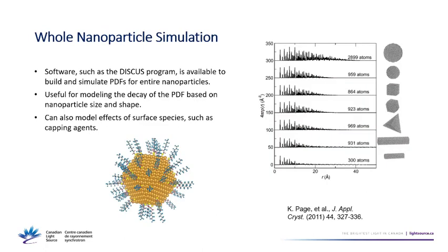And the last thing I want to mention is that there's also software. There's this program called DISCUS. It's not easy to use, but if you're really interested and you want to invest a lot of time into learning it, you can actually simulate entire nanoparticles.